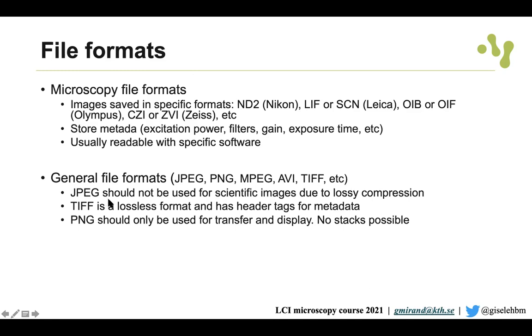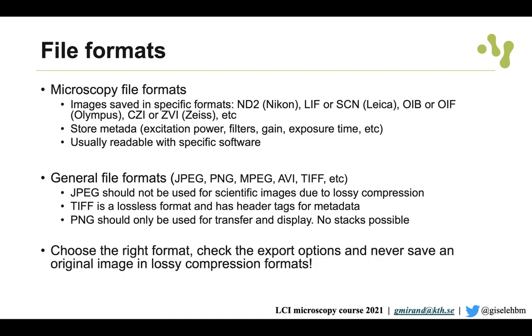JPEG should not be used for scientific images because of compression. TIFF is a good format, and we can also represent 3D images with TIFF. And PNG should only be used to transfer and display, so no stacks are possible here. So choose the right format, check the export options, and never save an original image in lossy compression formats.